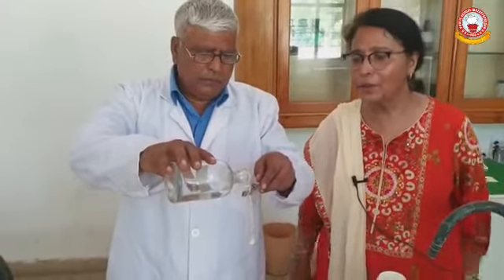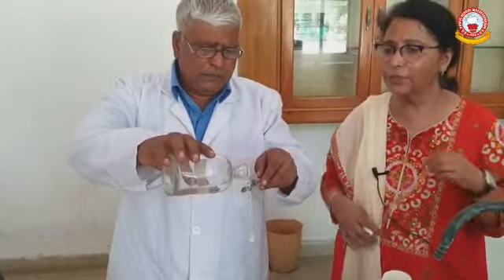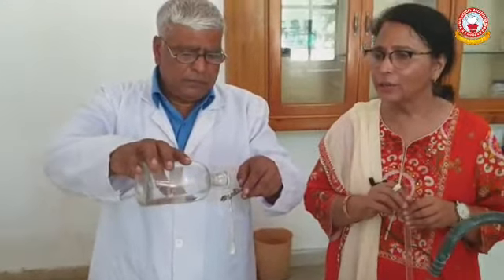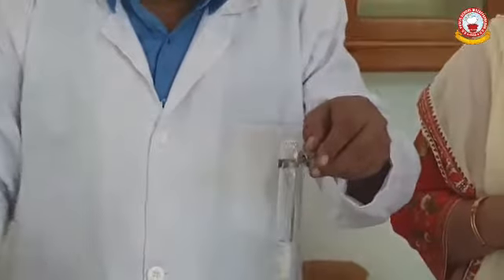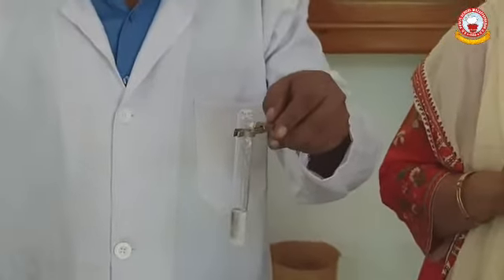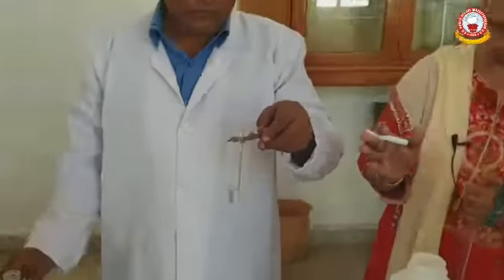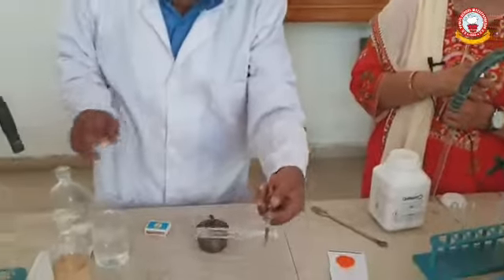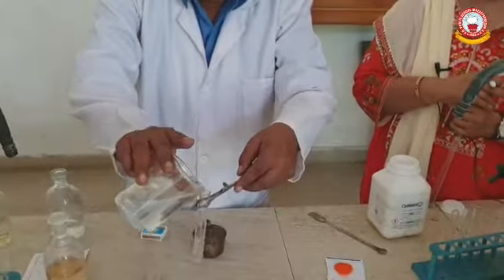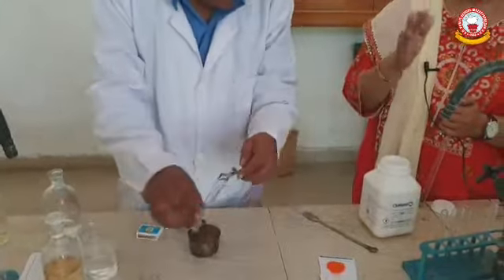Yes children, you can see now in the test tube we have taken the salt containing chloride, and to it the first step will be addition of dilute sulfuric acid to see if there is any change, and we will find that there is no change. We will throw the solution and we will take the salt again.